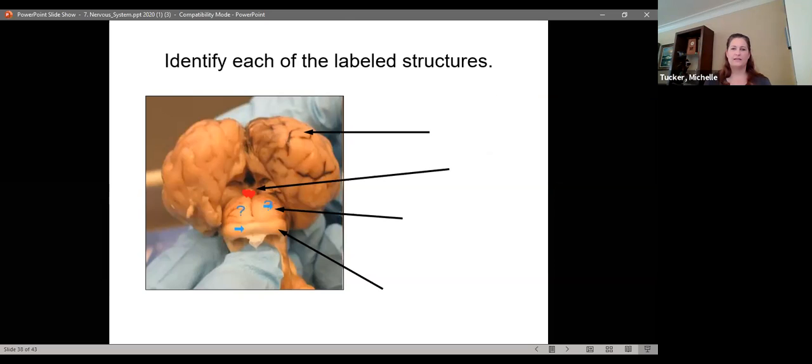And then an X at the cerebral lobe of the cerebellum. Oh, I'm sorry. I meant to say the occipital lobe of the cerebrum. Yeah, thank you. Yes, and you're right. The cerebellum is down here. So I kind of combined a few structures.